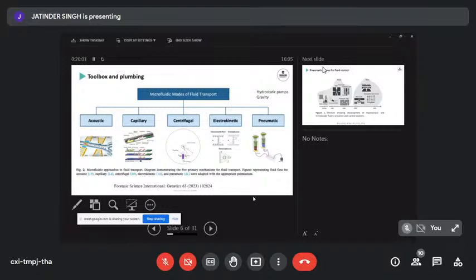And since then, they've been churning through millions and millions of research funding, getting an approved forensic analysis system to detect tandem repeats in people's DNA. And it's those tandem repeats that allow forensic people to tell people apart from one another. So they're, for example, used as evidence in rape crime.